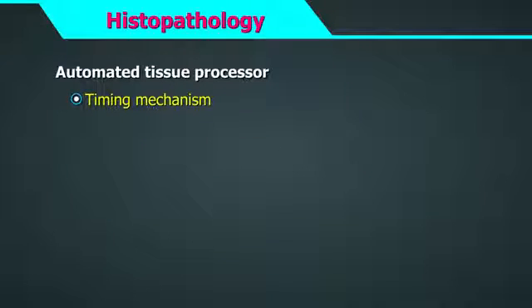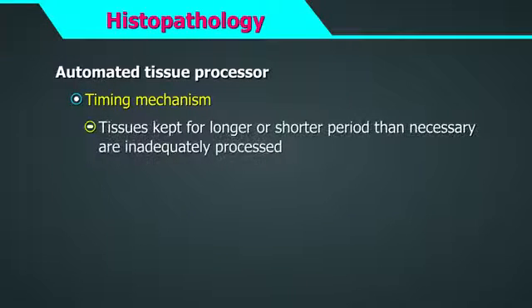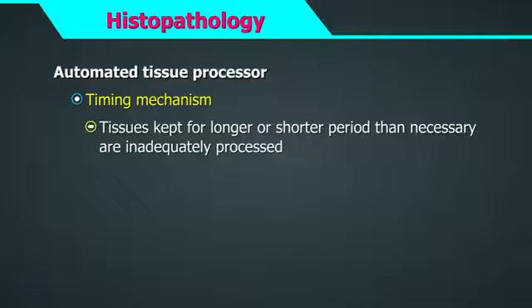Timing mechanism. Timer is meant to keep the tissue in different reagents and wax for an optimum time. If kept for longer or shorter period than necessary, tissue will not be adequately processed.